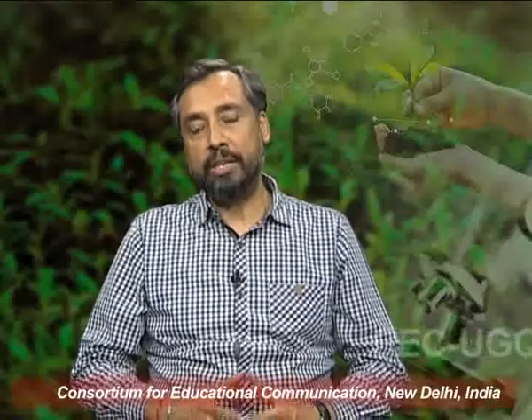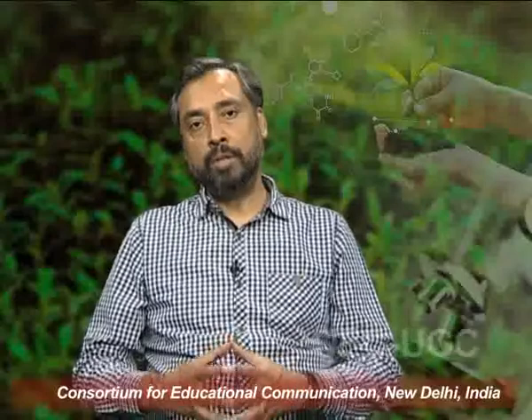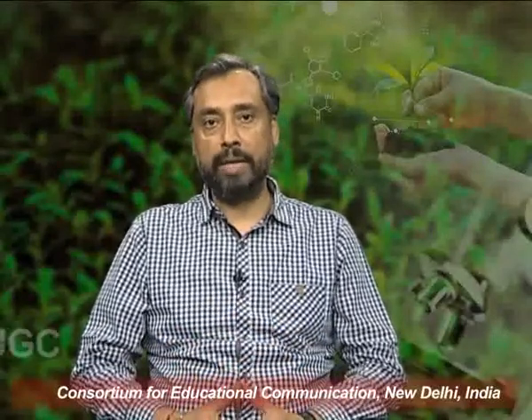So we shall talk about these 5 basic components of the electron microscope, and then we shall further move to study and discuss the transmission electron microscope in detail, and also different methods used for the preparation of material for electron microscopy in our next lecture.